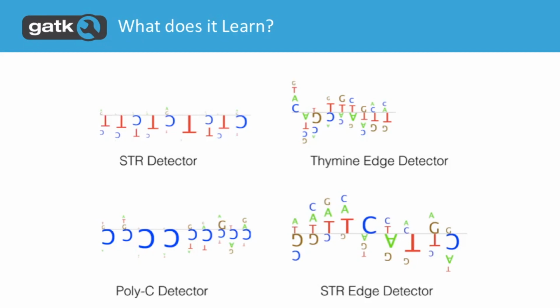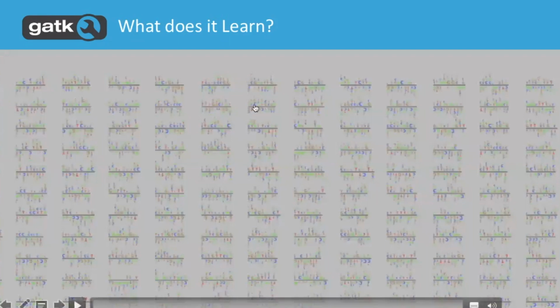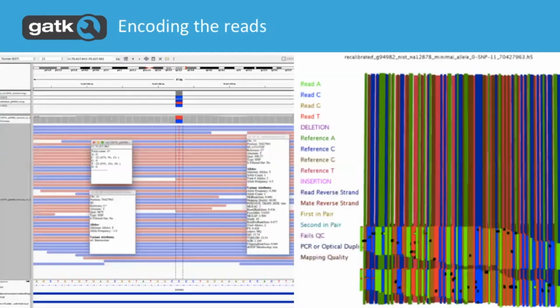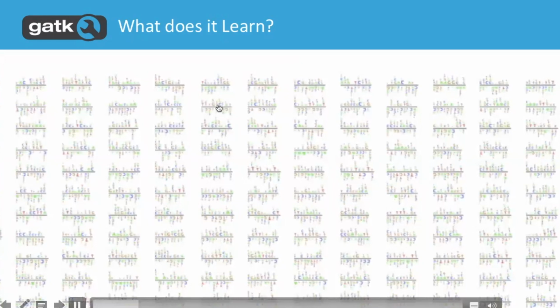How it was chosen, I'm not sure. Partially, a lot of the hyperparameters in the architecture were varied and then validated, and we saw how well we perform with each particular parameter selected. And so we train a lot of these position weight matrices at once, simultaneously.